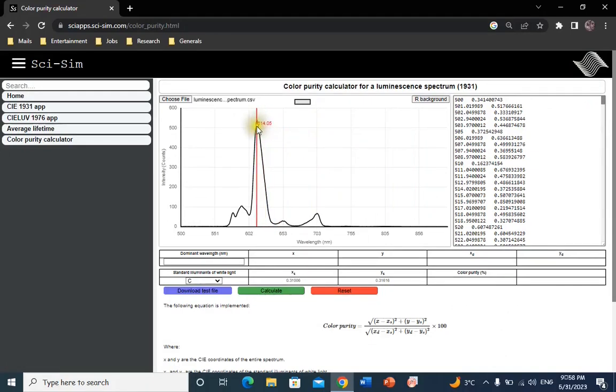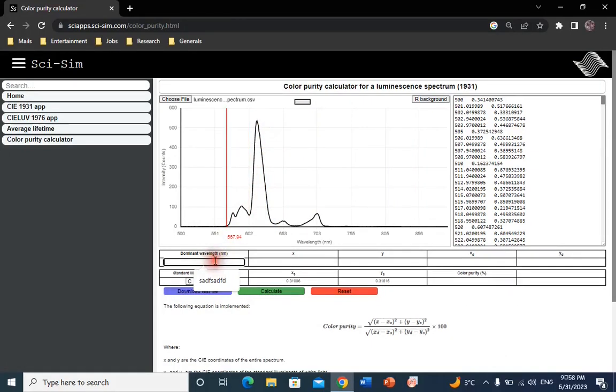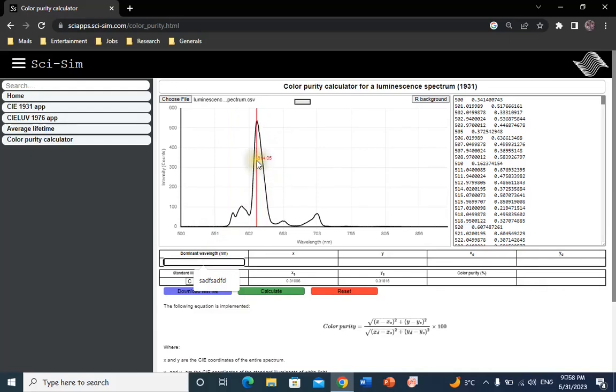Click on the dominant wavelength field to activate it. Hover your mouse over the spectrum to select the dominant wavelength and double click to add the dominant wavelength in the selected field.